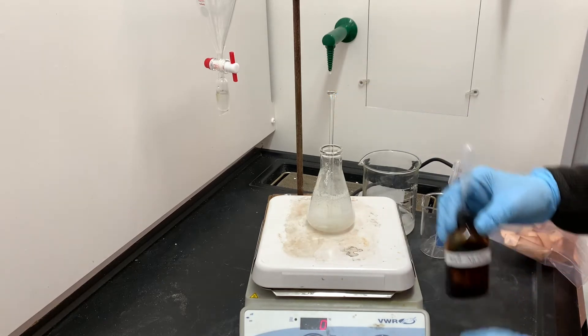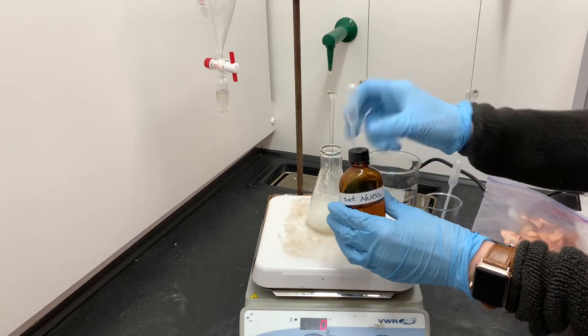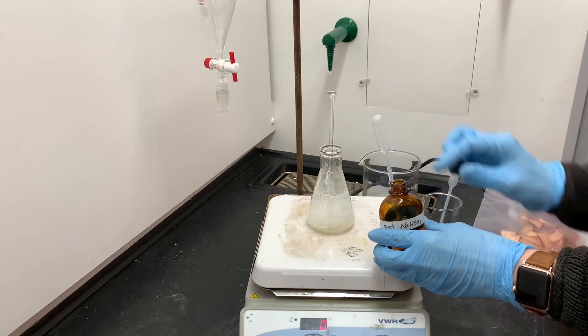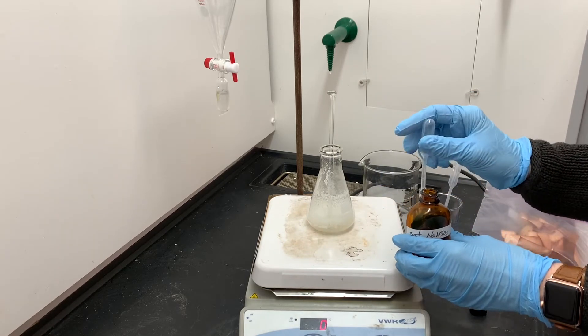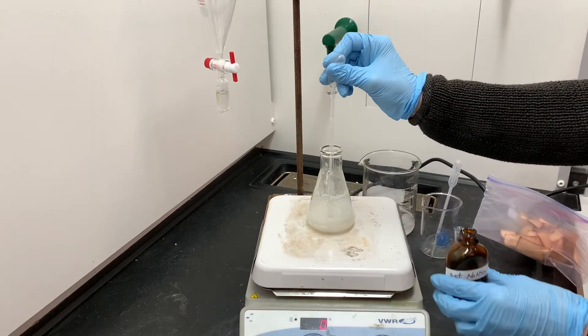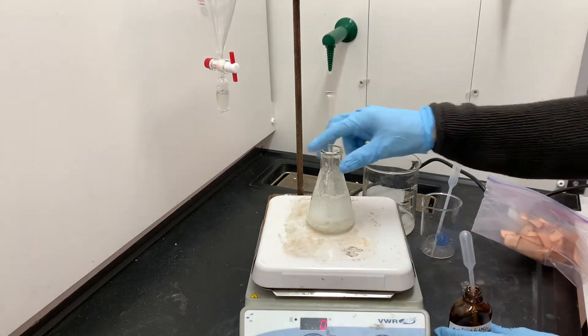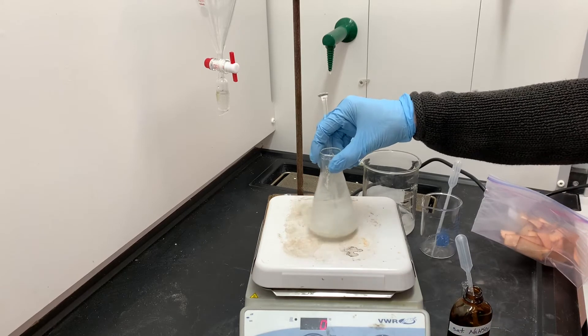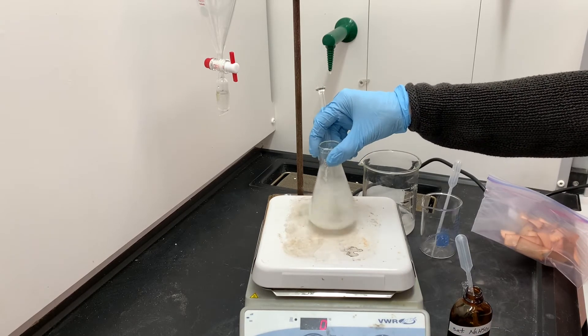To remove excess bleach, we'll be using a solution of saturated sodium bisulfite, NaHSO3. We're just going to continue adding the saturated sodium bisulfite solution until we get a negative test with the starch iodide paper. That means not a dark blue color change with the starch iodide paper.